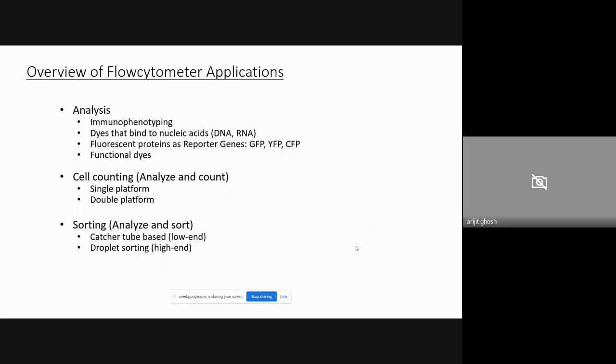One population expresses green fluorescence protein, one expresses yellow fluorescence protein, and some of the cells express both. If you need to collect the cells expressing both fluorescence proteins, then with a sorter, you can get the cells co-expressing GFP and YFP in your hand from the machine, which is a different machine from an analyzer.